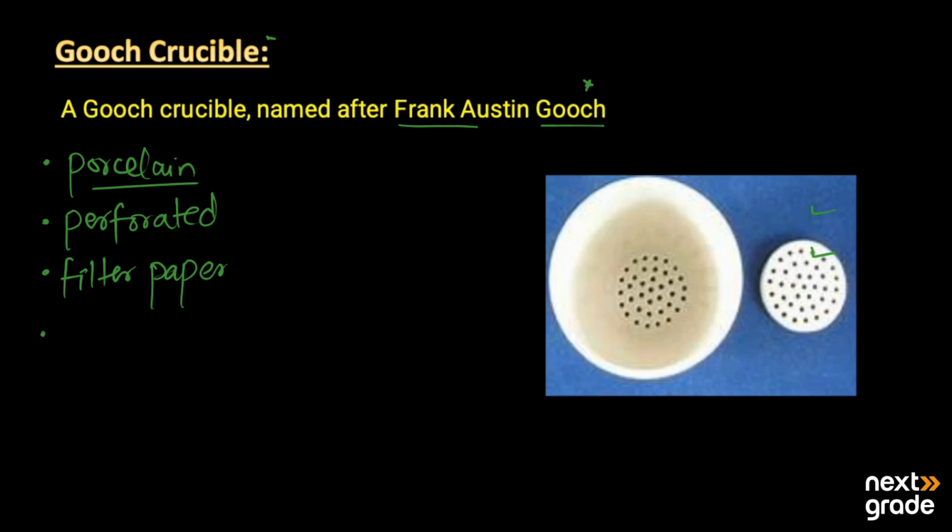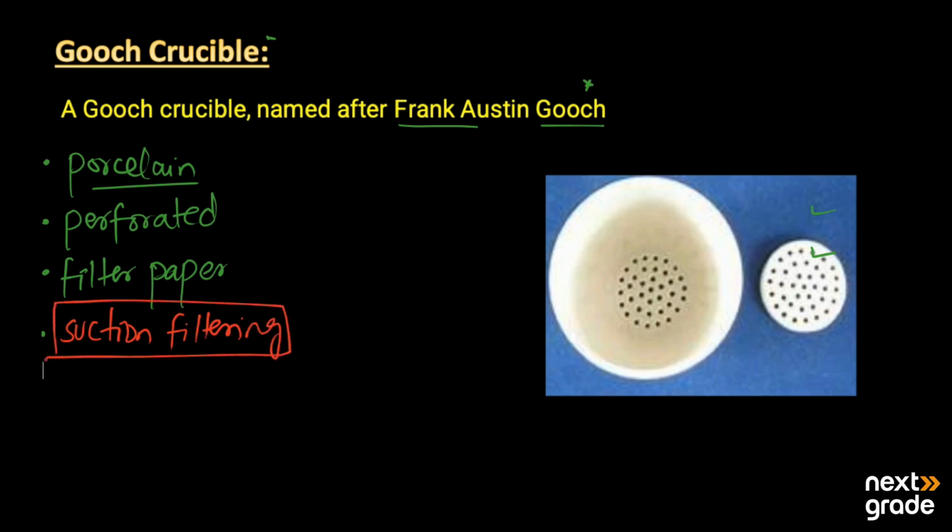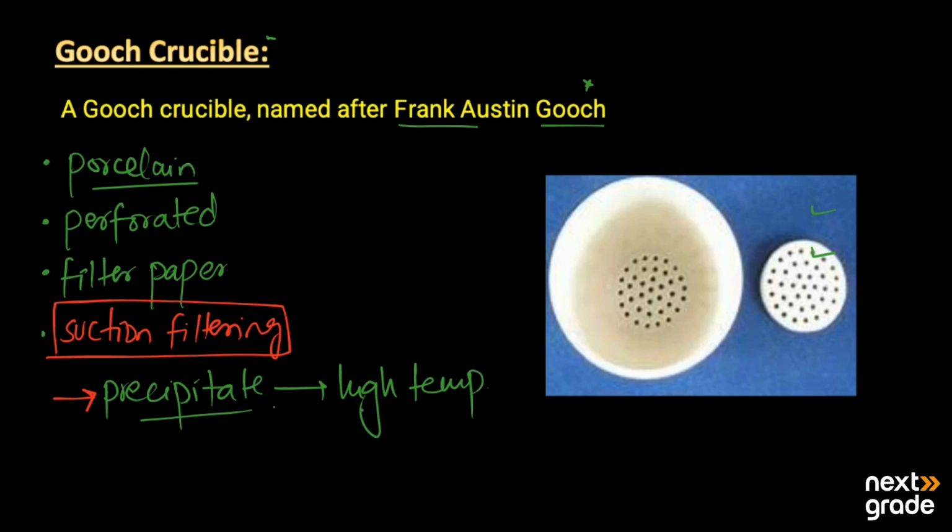The Gooch crucible is also fitted with a suction filtering apparatus. What is the main purpose of the suction filtering apparatus? It is useful for the filtration of precipitates. Now, what type of precipitates? Mainly the precipitates that we need to ignite at high temperature. So this is the main purpose of the use of the Gooch crucible.